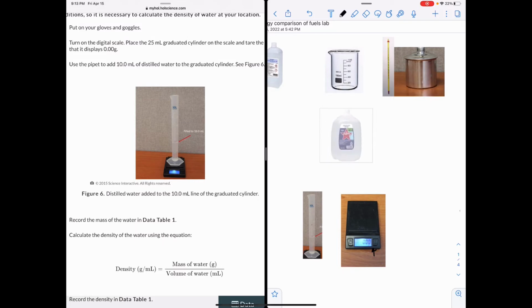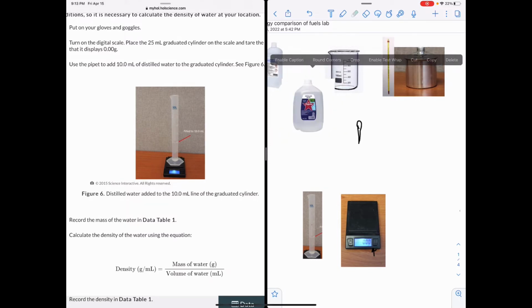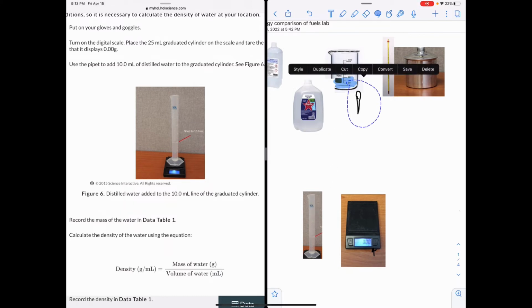And then you're going to get your dropper. I don't have a picture of a dropper, but it's kind of pointy, and it's got the little bulb at the end of it. This is why I was saying, pour some water in the beaker, right there. Make it blue. What you have left over, you can really easily access with that little pipette, get a few more drops, and actually make it line up so that it really is right at that 10 milliliter marking. You do need it to be 10.0 milliliters.